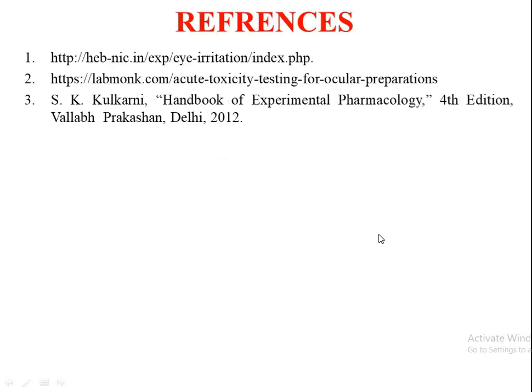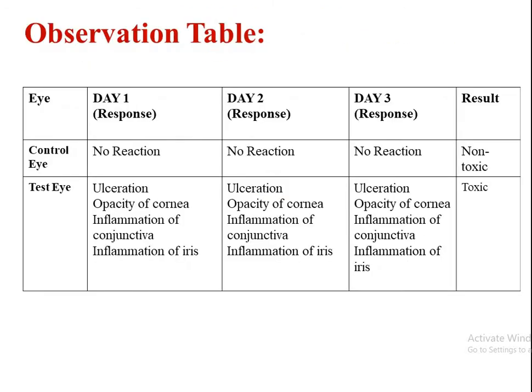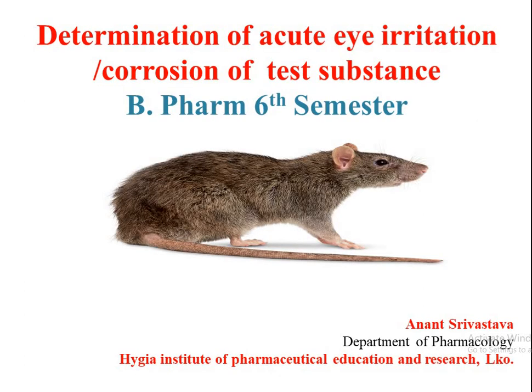So this is all about this experiment, the information that I gathered from these references. So this is all about the determination of acute eye irritation corrosion of test substance.